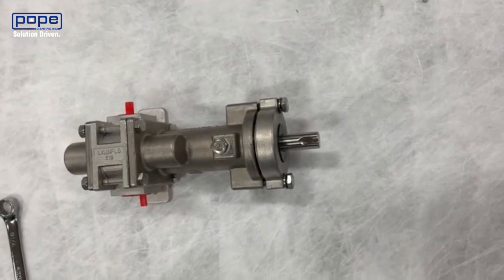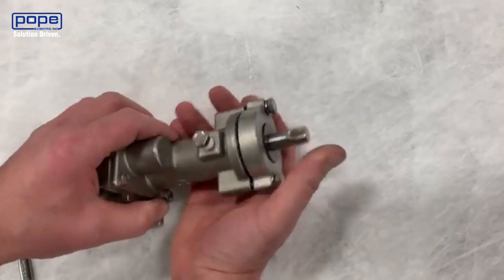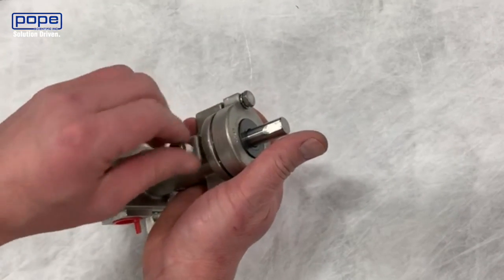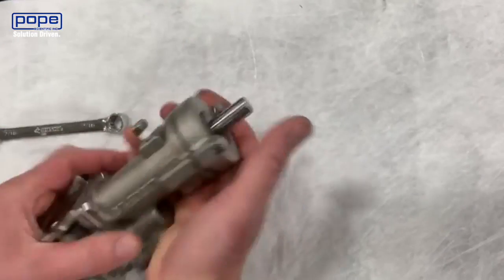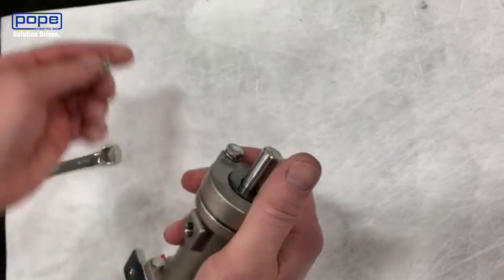To take apart the pump, the first thing we're going to start with is removing the mechanical seal. In order to do that, we have to remove the plugs on the unit. We'll do that using a 7/16 wrench, removing both plugs.